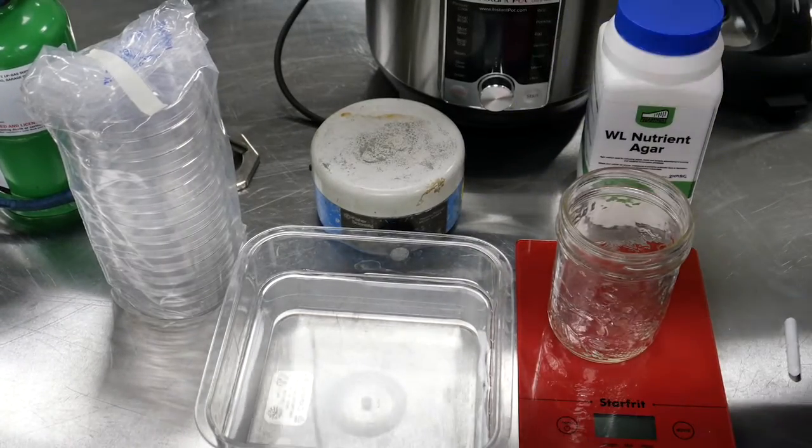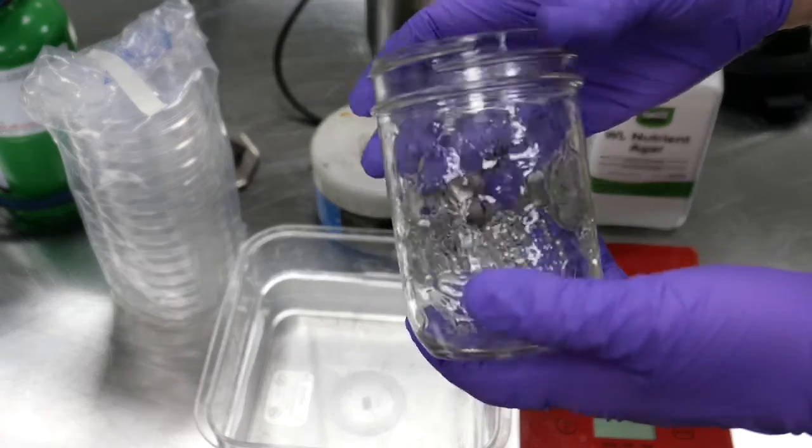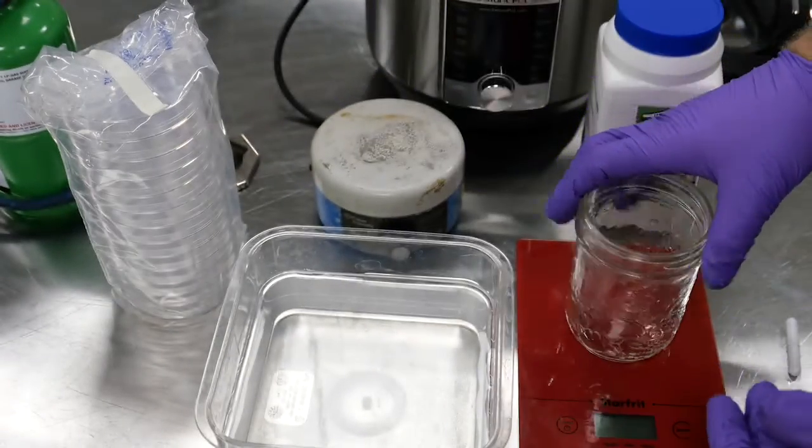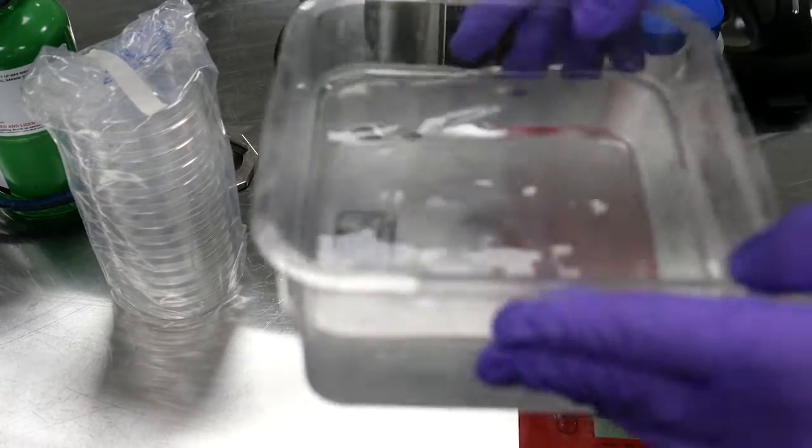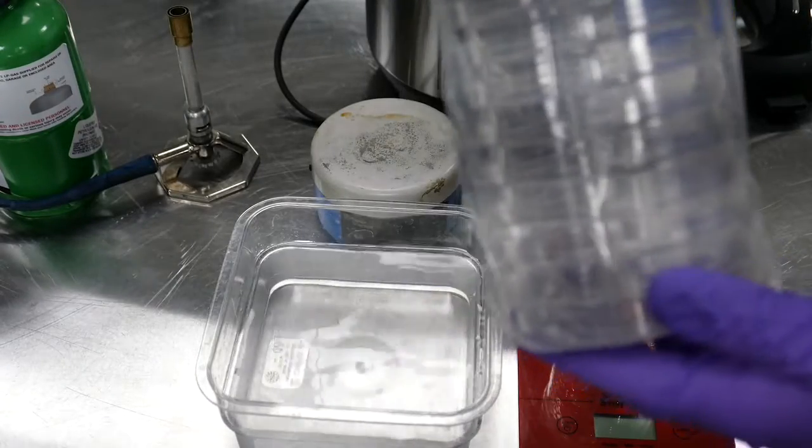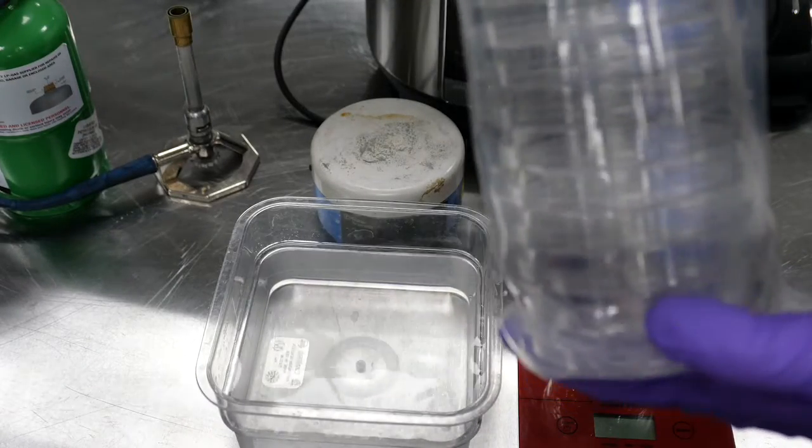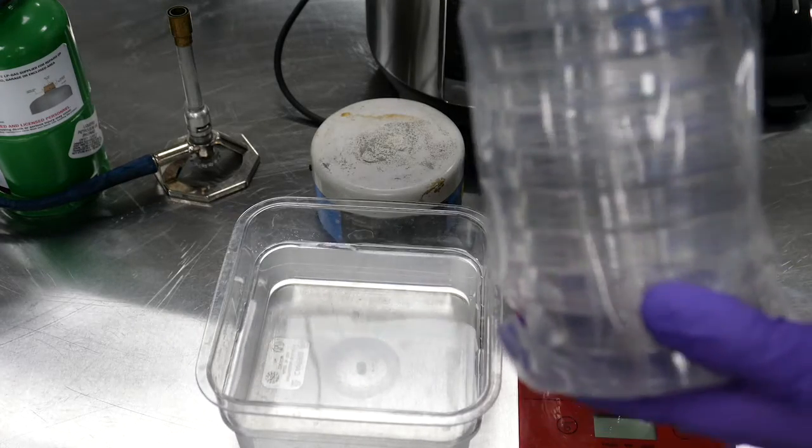To do this you'll need something to mix your agar in. Here I'm using a simple mason jar. You'll need some distilled water, and you'll need some sterile petri dishes. You can buy these pre-sterilized from scientific suppliers or from Amazon.